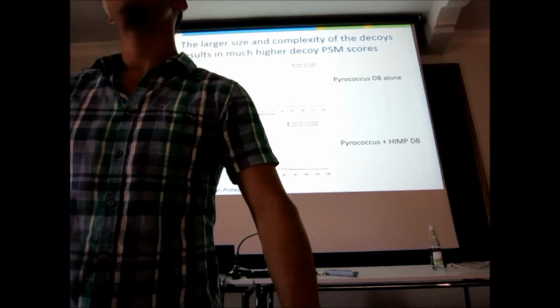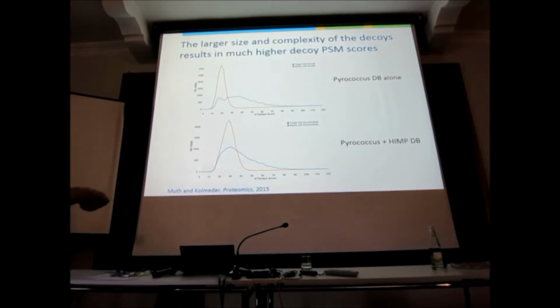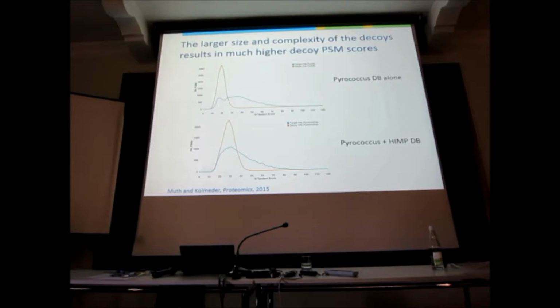The hits that we get are most likely false. So any increase in the blue curve is wrong. So this is not a good picture, right? So we make our FDR tougher, and whatever gains we have, we should probably not trust, in this particular case.